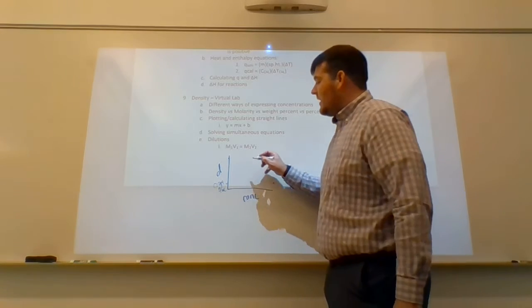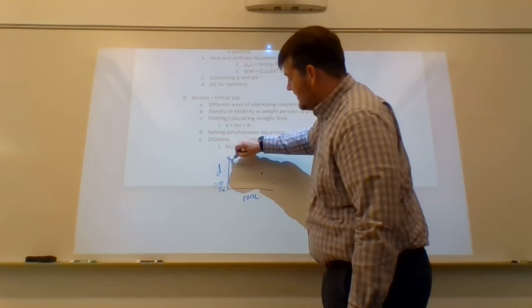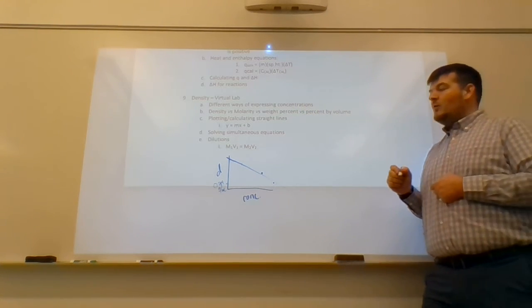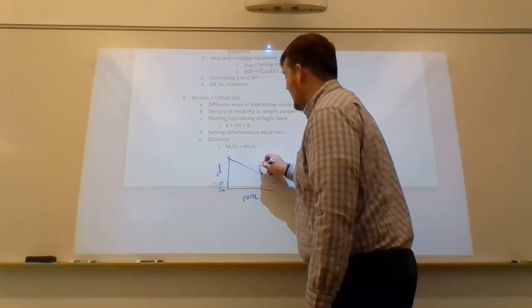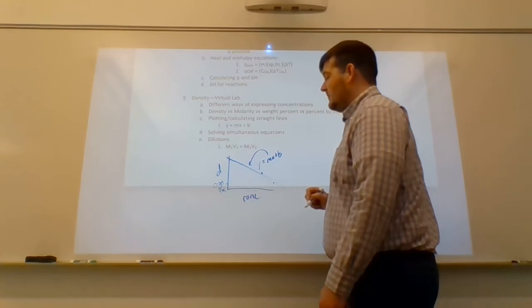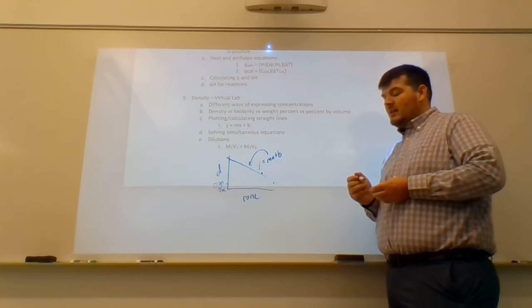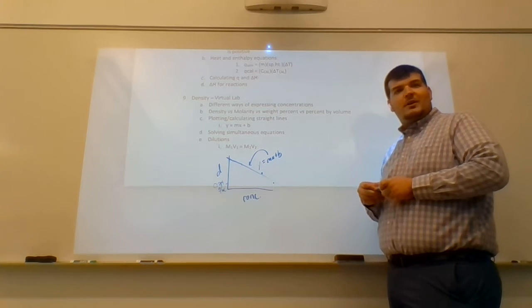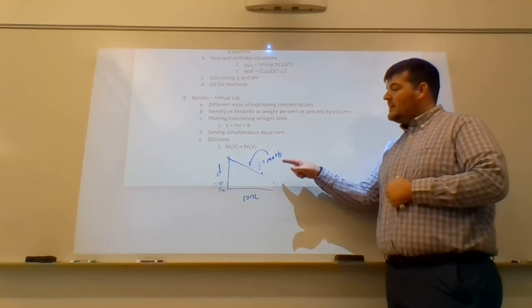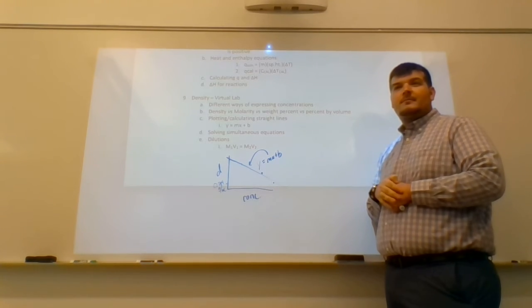So then after that, you put in a couple other dots here, based upon concentrations that were given to you. And then you plug that value into Excel. What did Excel do? It gave you a y equals mx plus b equation for this line. And then what did you do? You calculated the density of the two unknowns. Once you got the density of the unknown, what did you plug that density in for, y or x?